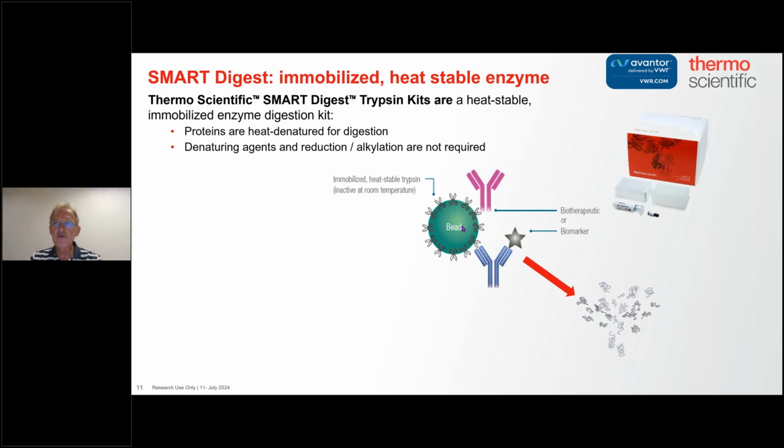Now, if you do an in-solution digest, you need to know the protein concentration. Then you'll add the trypsin amount at, say, a 1 in 25 ratio or 1 in 50 ratio. But if that ratio changes, your digest changes. So you have to do a protein concentration.